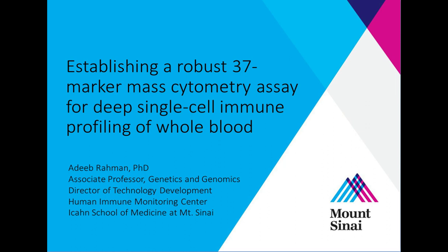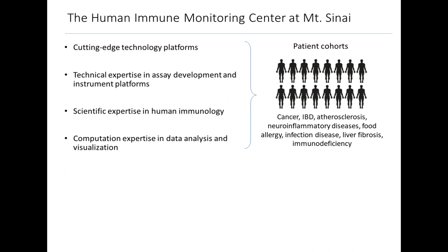Thanks, Mona. Following on Mona's presentation, I was going to go through and show you an example of a specific project in which we've been deploying some of these REA antibodies for immune monitoring purposes. But before getting into that, I want to provide a little bit of context for where this work is being done and how it falls into our broader range of operations.